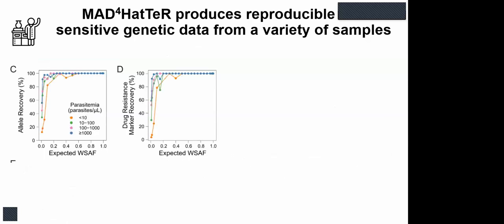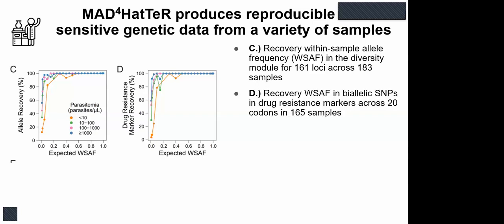So continuing with the sensitivity, we also checked sensitivity from the genetic data of a variety of samples. And we are looking here at the allele recovery versus the expected within-sample allele frequency. And we are seeing that both for the diversity panel and the resistance panel, the pickup is quite good.